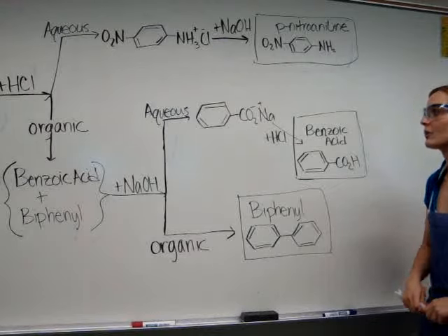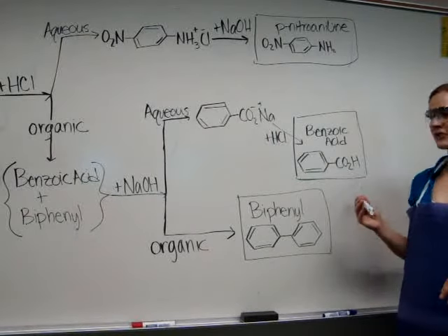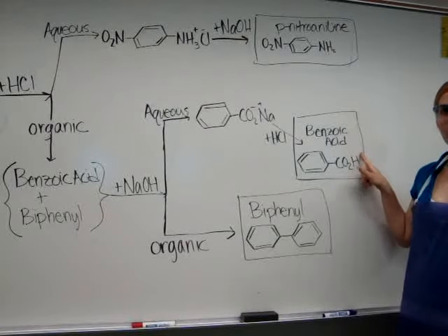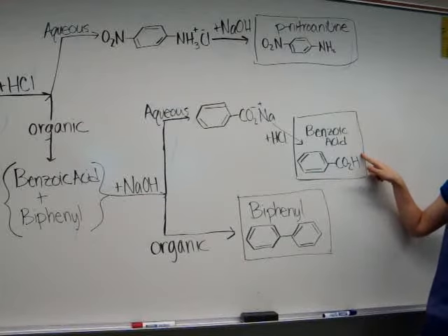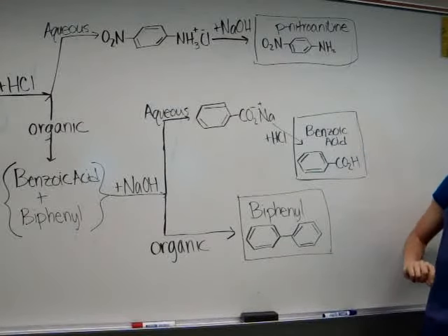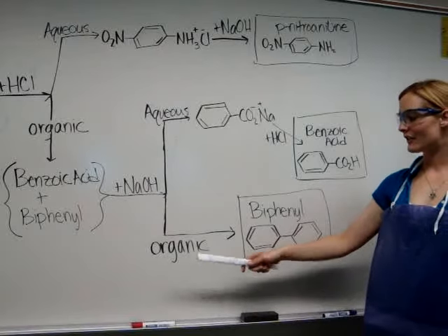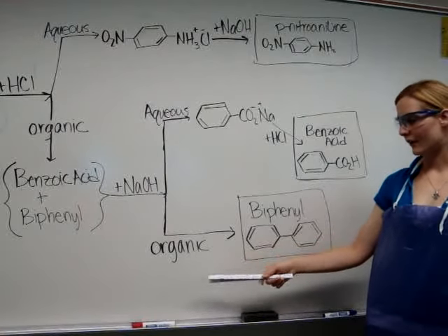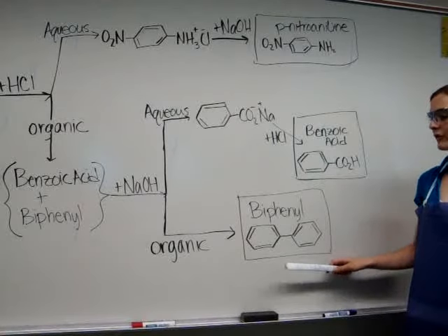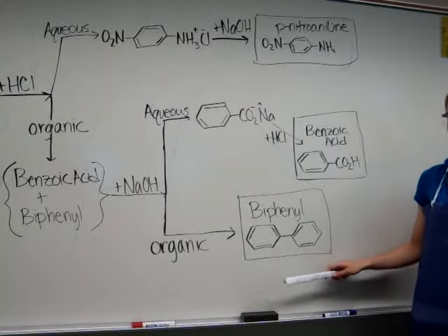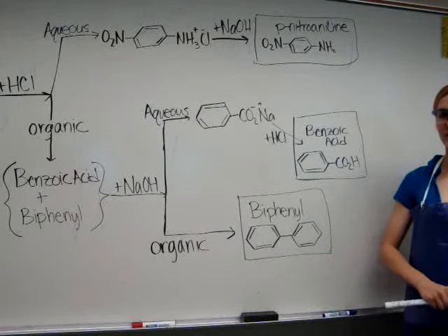Again, you want to remove the aqueous layer and crash out the benzoic acid by neutralizing the solution with hydrochloric acid. Now, in the separatory funnel, you will remain your organic layer which only has the biphenyl. You will remove the organic solvent left in the solution by rotovap, which we'll show you how to use later.